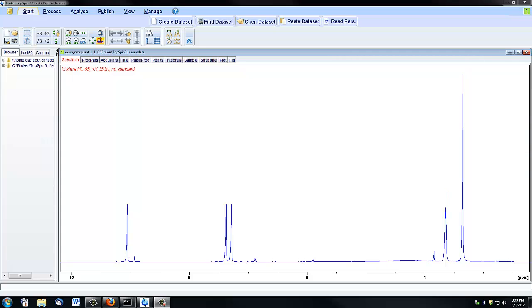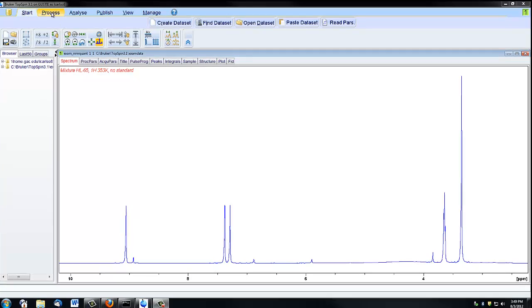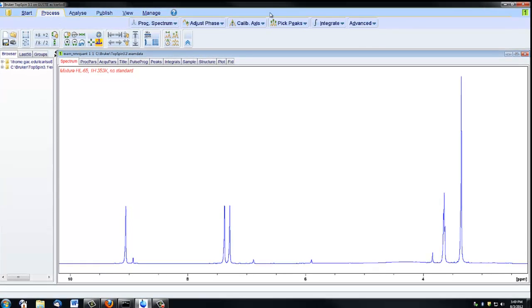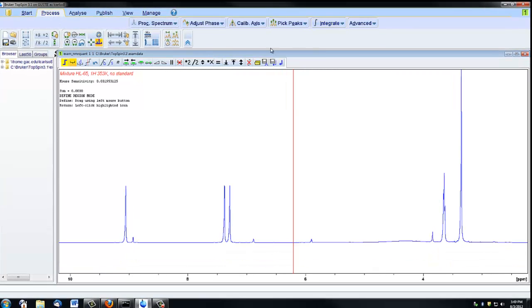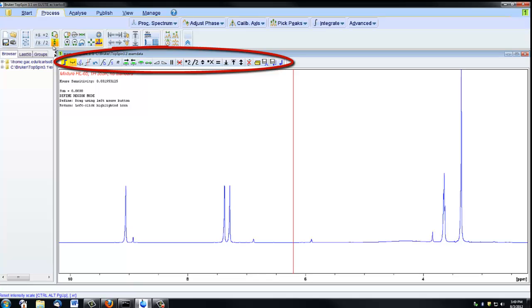This video will demonstrate how to integrate peaks using Topspin. If you click on the Process tab and then select Integrate, you'll get a new menu here that you can use to integrate the peaks.